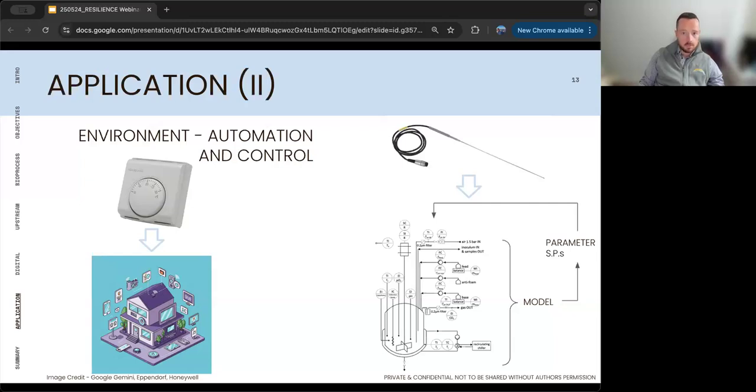But a bioreactor environment isn't that simple. There's a myriad of different conditions that you're trying to control to keep your cells happy and growing, many of which have an influence on the others, but they're not being controlled as though that's the case. And so they're all kind of competing to a certain extent.